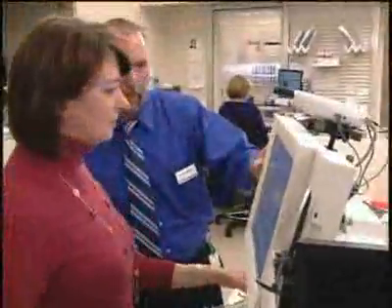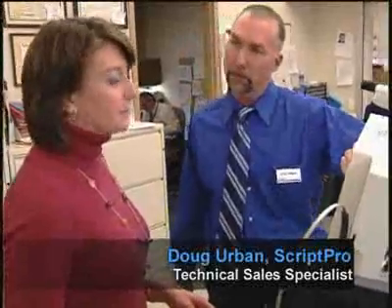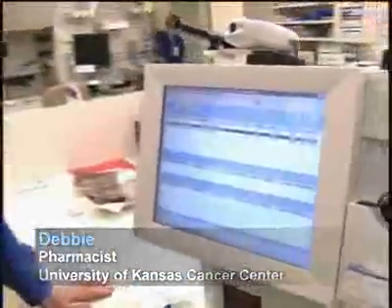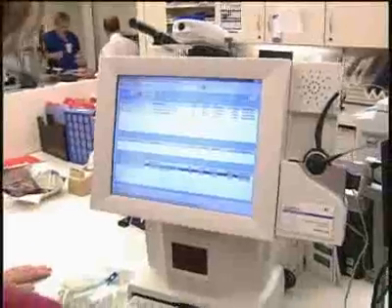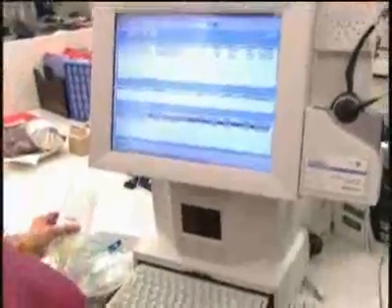I was just looking at a display up here, and I see that we have a couple of scripts for a patient that are filled. Is the next step verify? It is. I have 2 here for this patient. I can highlight one and drag it down, and it'll drag both down. They're ready to go. I have a carboplatinum here, which is my first one that I'm going to look at.